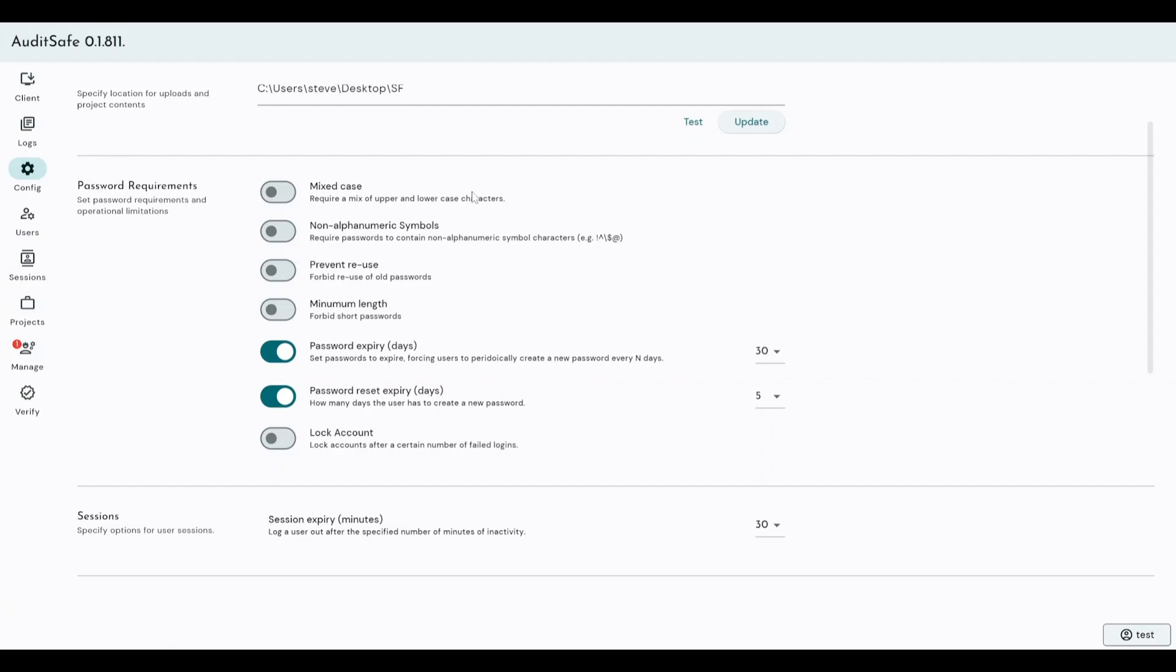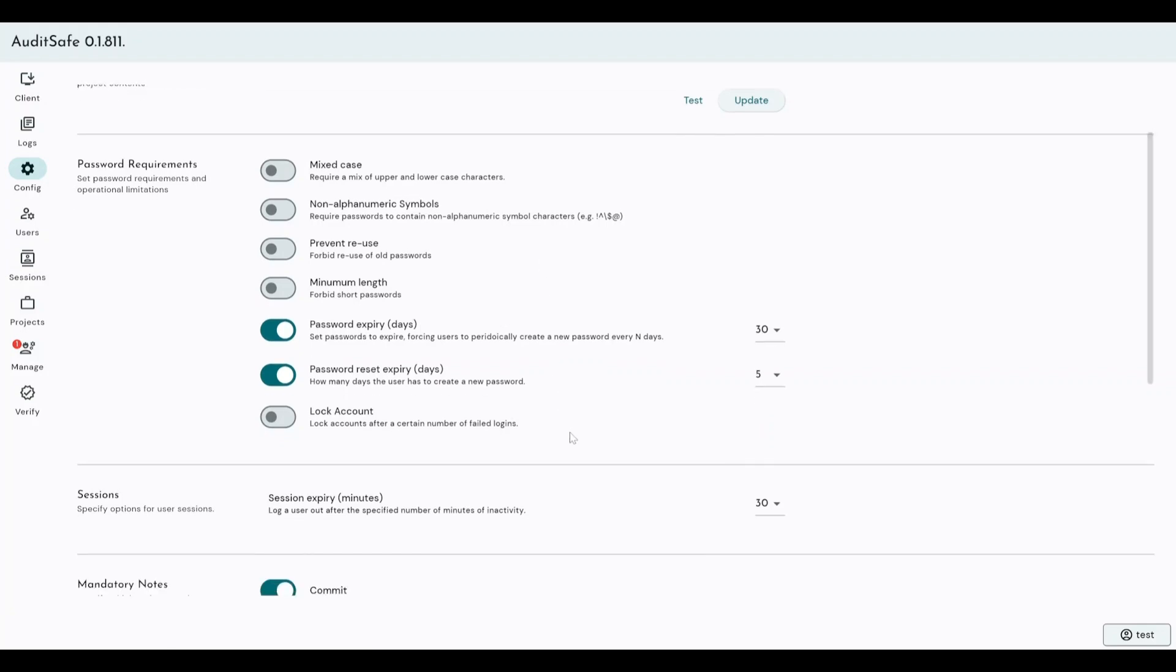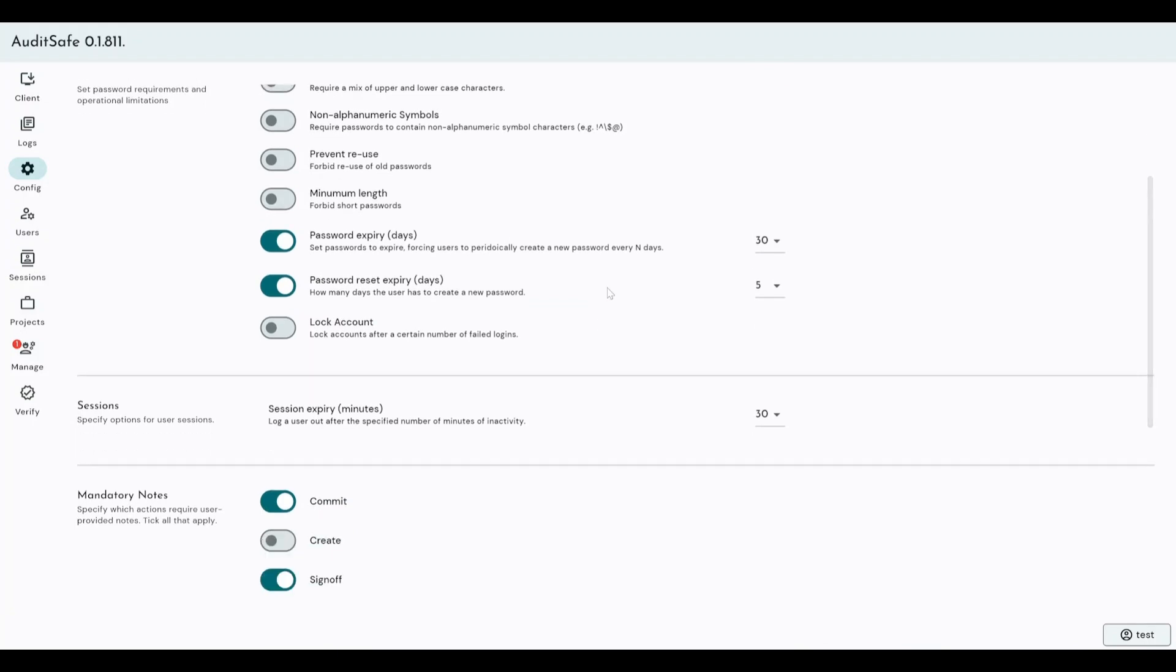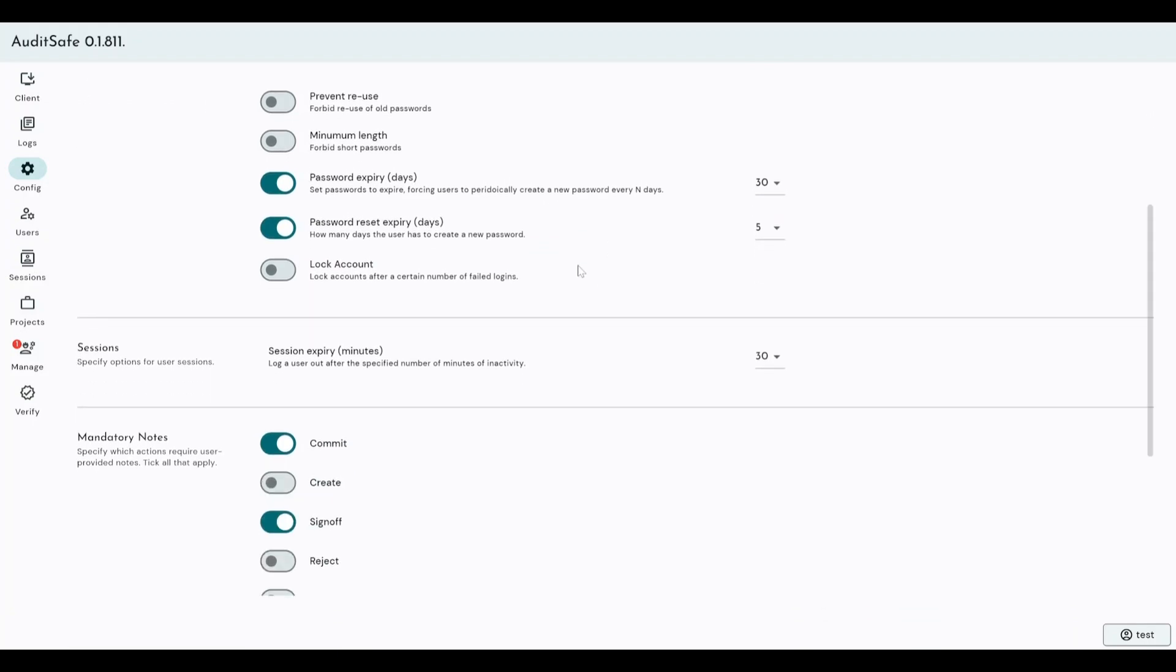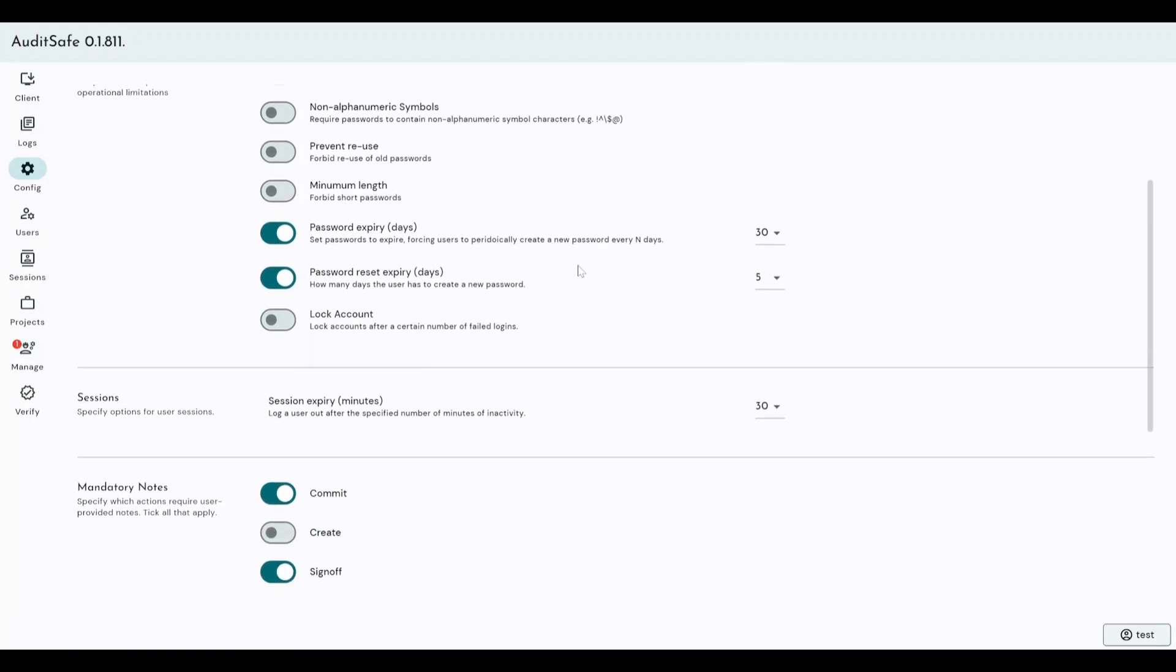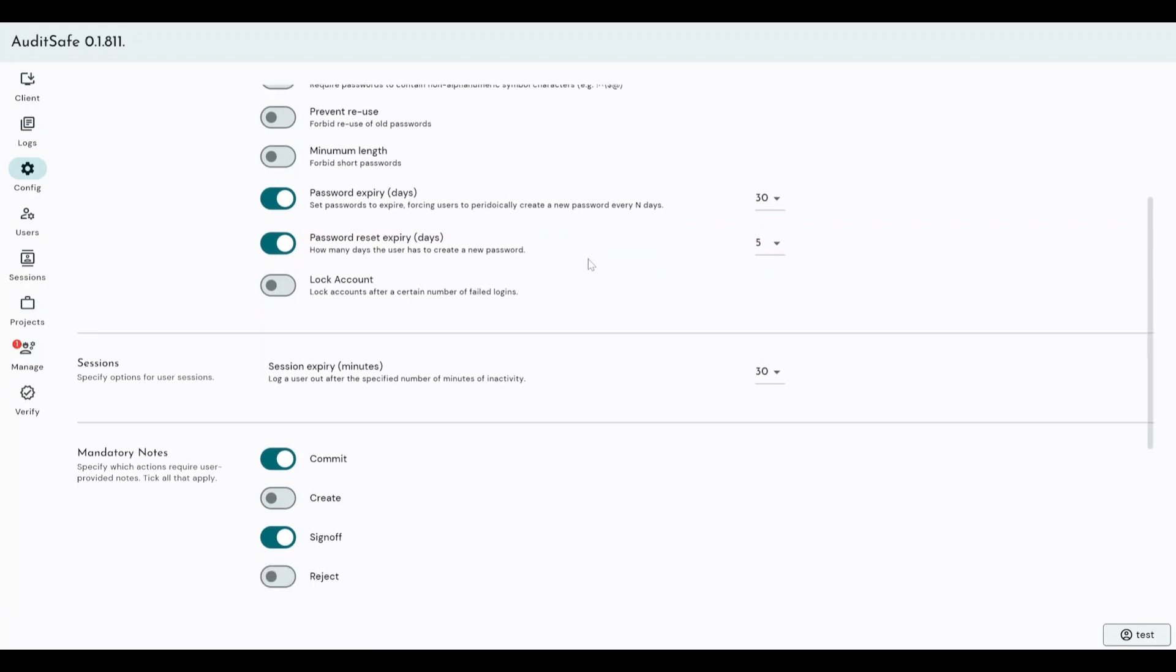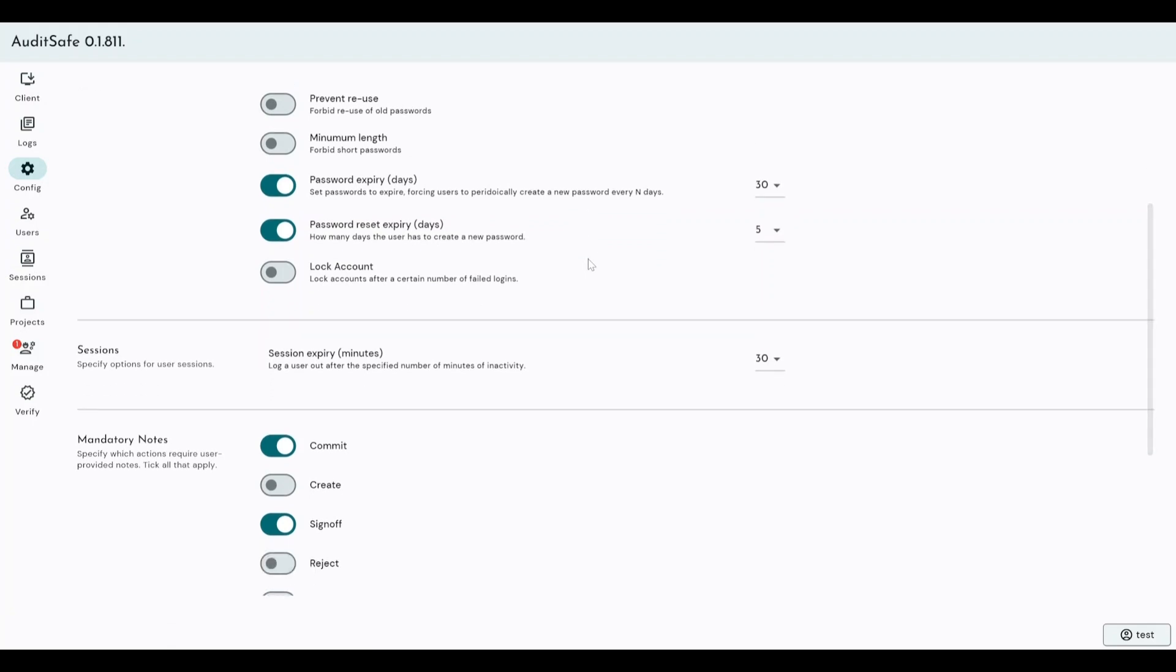If you're using Windows Active Directory users, your Windows password will be managed by Windows and we don't have any control over that. If you're using internal Auditsafe users, this is where we can define a number of parameters to ensure the security of users' passwords. We can ensure mixed case, non-alphanumeric symbols, prevent users from reusing passwords, enforce a password expiry after a certain number of days, minimum length, lock accounts after a certain number of failed logins. All of those industry standard security measures based around passwords that we're all aware of when we create accounts online.